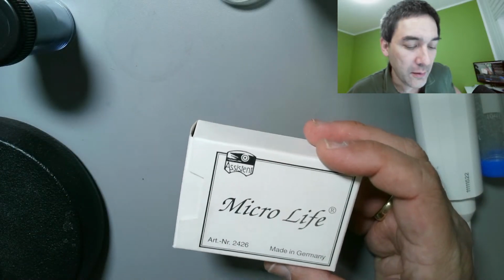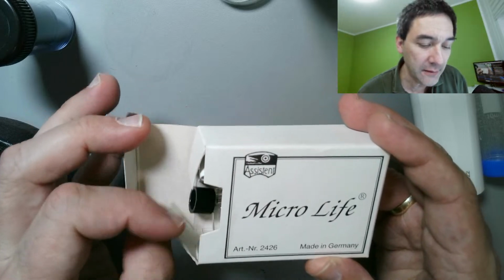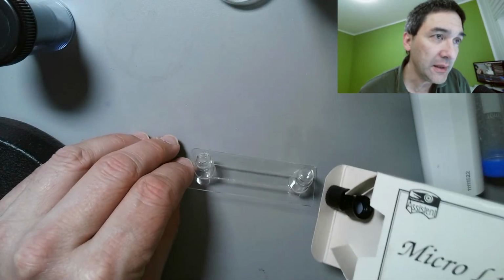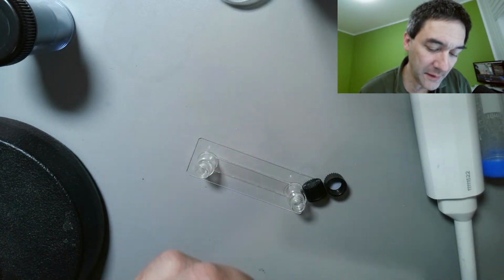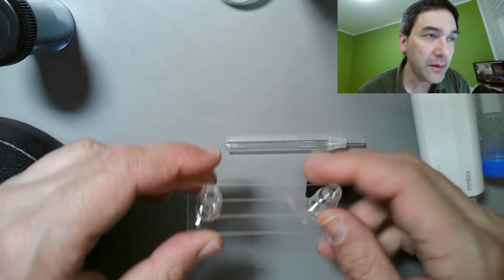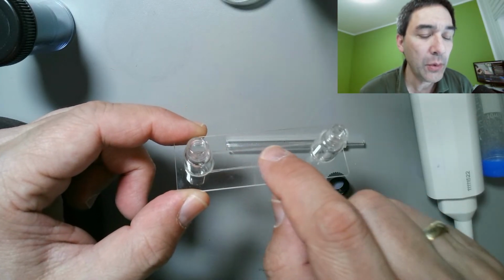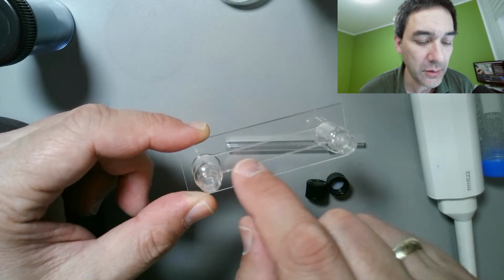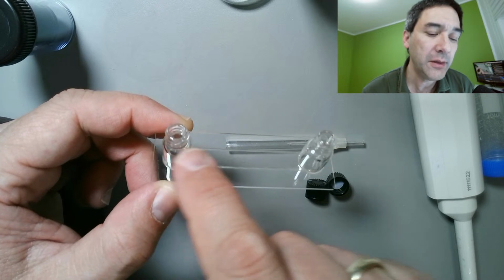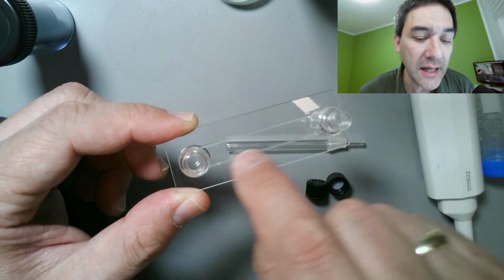I used it once or twice already. It's pretty delicate. It's called a Microlife, they call it. Okay, I just want to show this to you. It's a pretty delicate device. And look, it even comes with a pipette here. And indeed, there are 2 containers here, right? And there is a small tunnel, or I don't know what you call this, path here. So what you can do is fill in a water sample in here. It will spread, and it's thin enough that the microorganisms can actually move along.